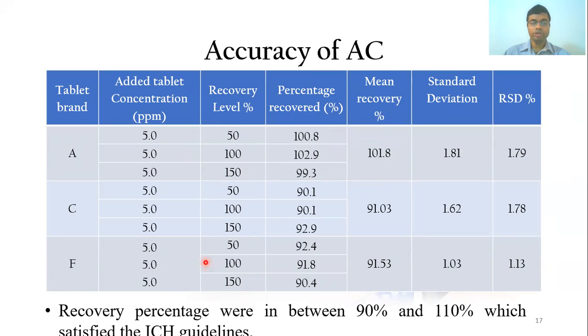Here we have spiked a certain fixed concentration into 3 different brands of tablets. We chose our samples beforehand, and then we spiked our sample standards into them.